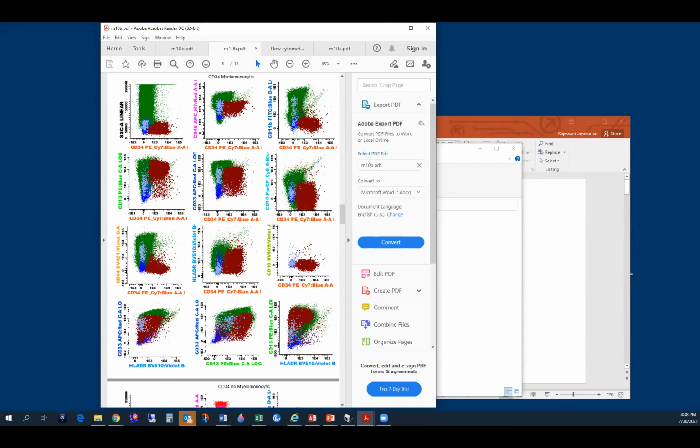First, you will have this blue population, which are the stem cells that are negative for 34 and 13. Then there is this blast stage where they are positive for 34, negative for 13. Slowly they will acquire 13 and become positive for 13. There is one stage where they're still positive for 34, and then when they become promyelocytes, they lose 34 and have 13. Same way for 33. So this looks like an inverted C.